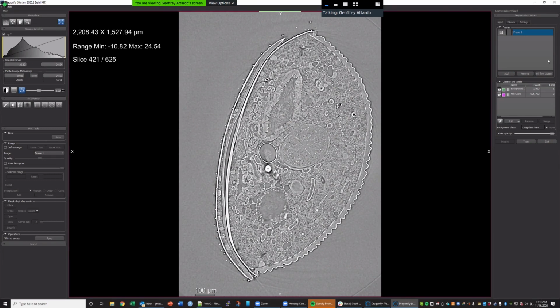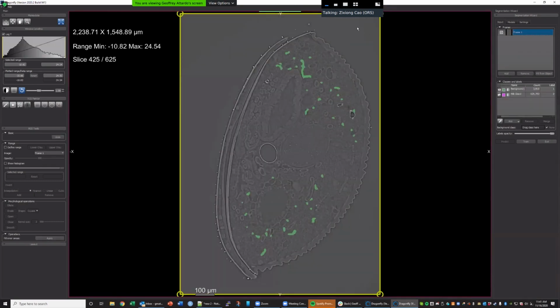You can probably change the size of the frame a little bit, because this outside area you are not very interested in, and it will take more time for training and applying. So you don't need to have it.